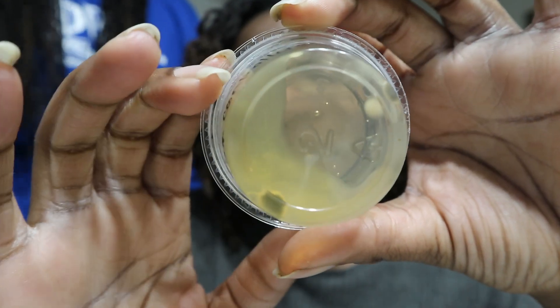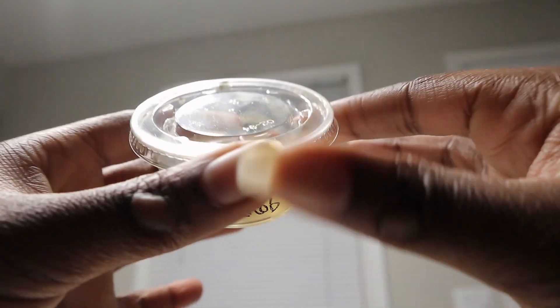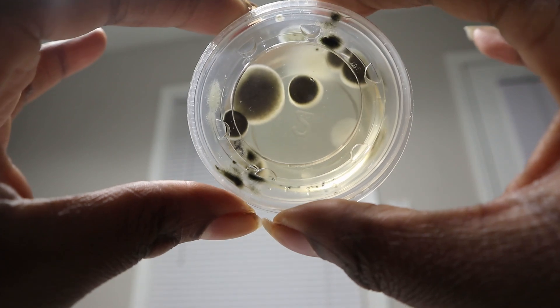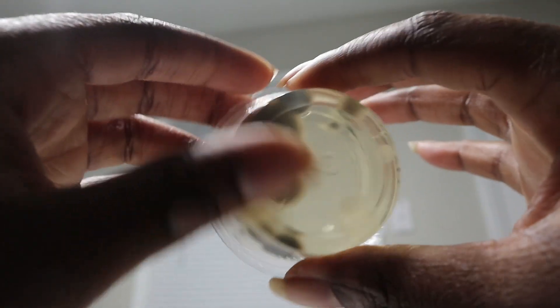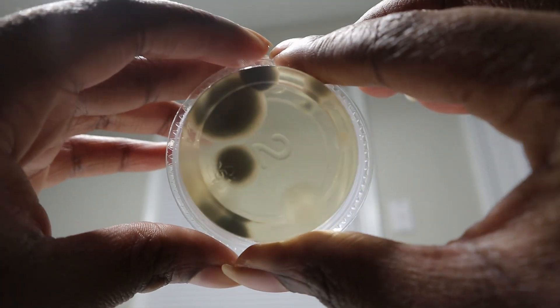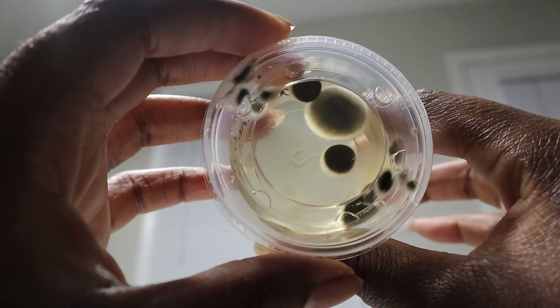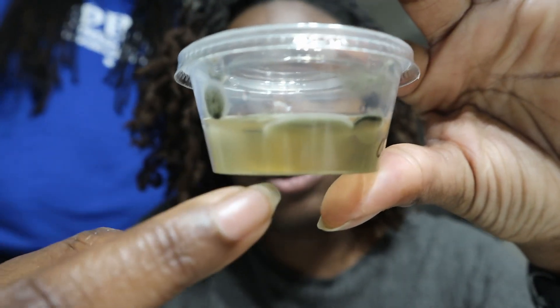The next one was the doorknobs. I swabbed the outside doorknob and it had basically the same thing as the HVAC. What was different about this one is that it had growth throughout the entire agar — there's growth just throughout the agar.